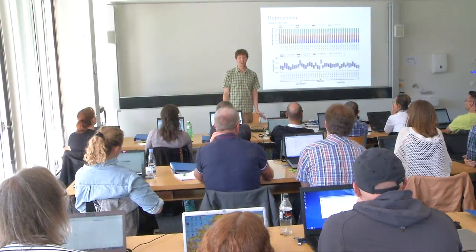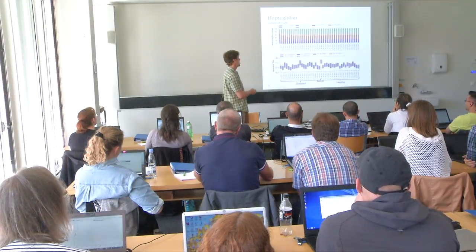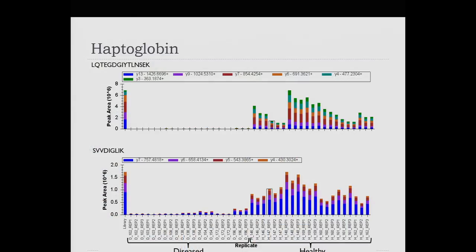Weak signal where? Yeah, so we're going to have less signal over here. And sure enough, this is what happens. Looking on a linear scale, on a log scale you'd be able to see both. But on a linear scale, the peak area in the diseased cohort is almost invisible at the level of the signal in the healthy.